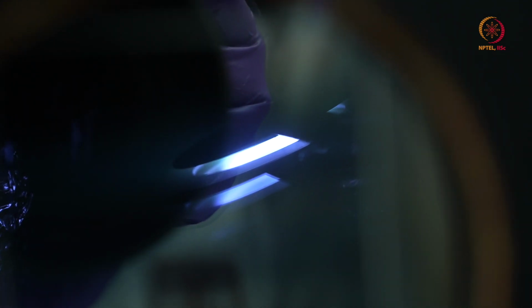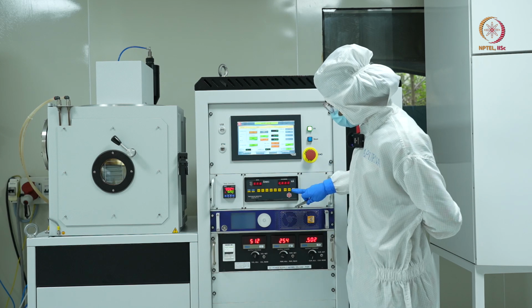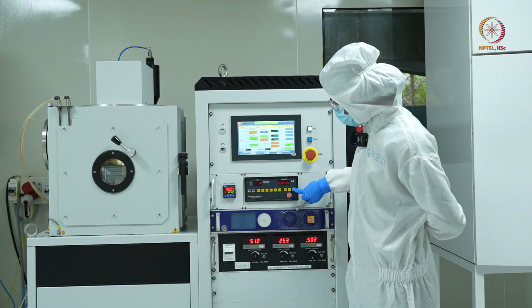You can see there is a shutter which is stopping the deposition from happening on our desired substrate. Once I open this shutter, the deposition will start happening on the substrate. Now we'll switch on the DTM as well, and I'll press stop.